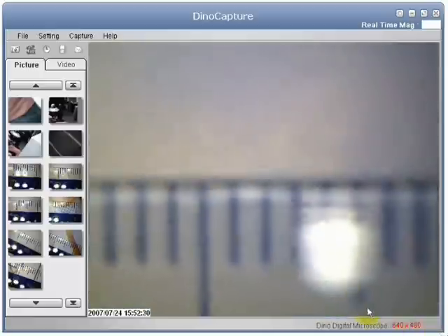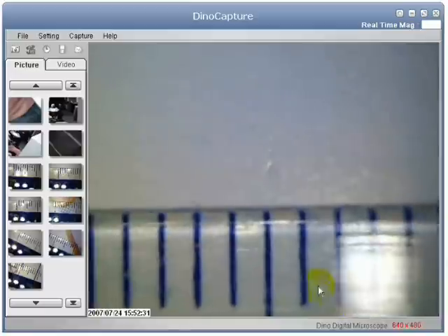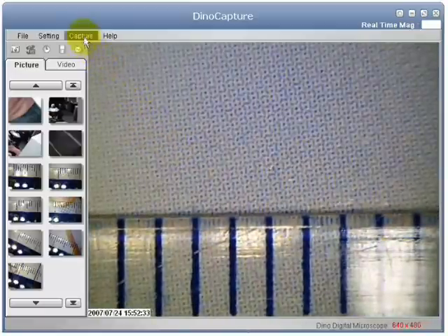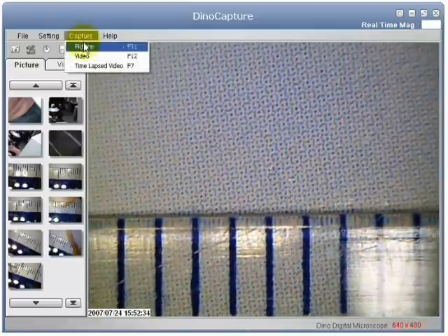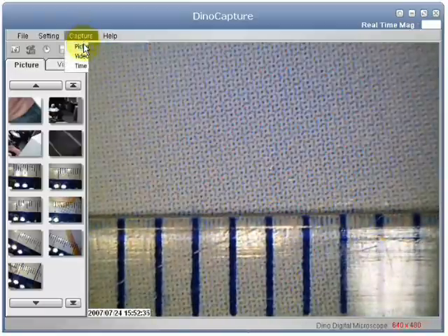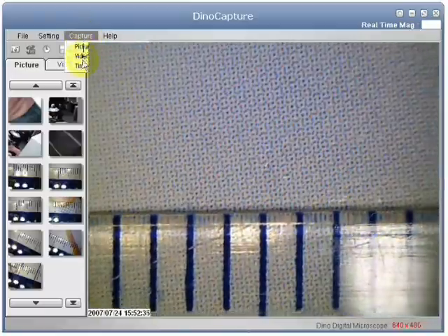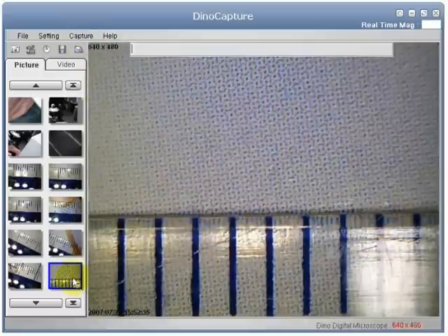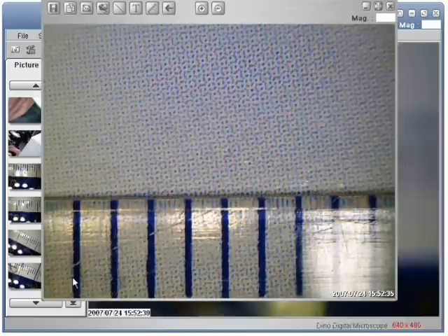First, take a picture. Once you have taken a picture, select the picture you want to use and double click it.